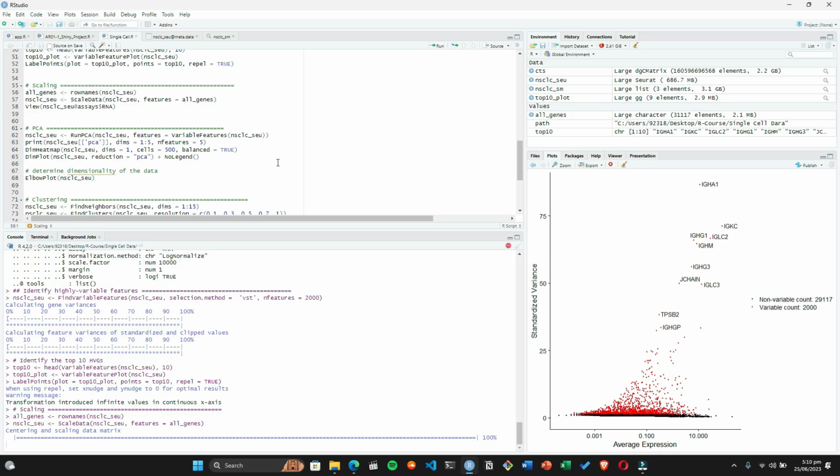If your computer doesn't have that kind of space, you can't run the single cell sequencing analysis in R. And I am going to give away this code. I think I shouldn't, but you can get this code from my GitHub account. You can use this to analyze your results because I think the code should be available to you so you can use it easily for your analysis.